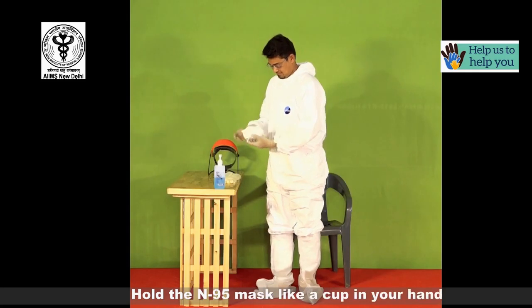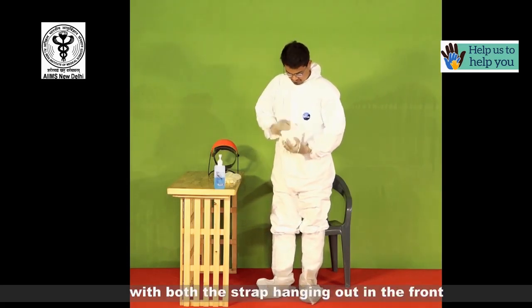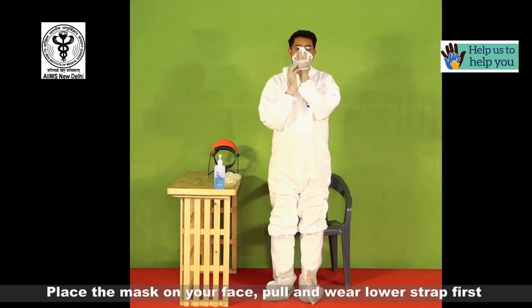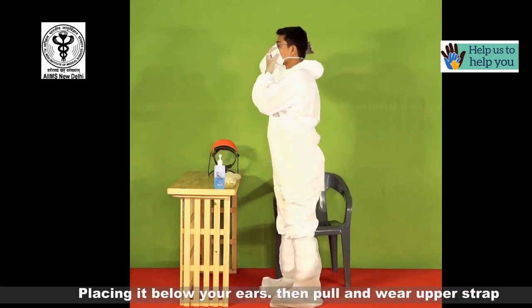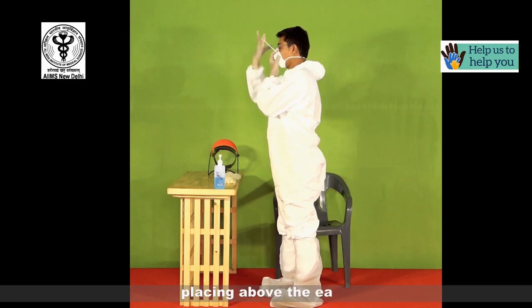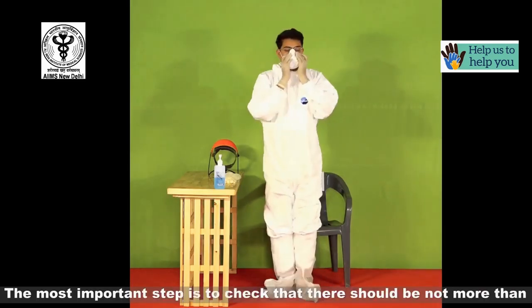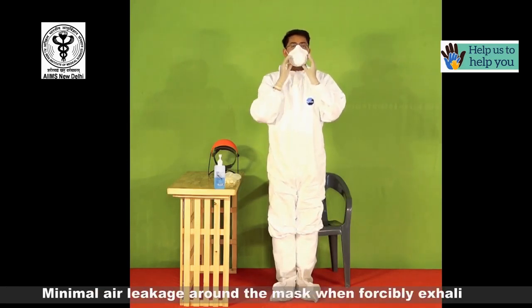Hold the N95 mask like a cup in your hand with both the straps hanging out in the front. Place the mask on your face. Pull and wear the lower strap first, placing it below your ears. Then pull and wear the upper strap, placing it above your ears. The most important step is to check that there should not be more than minimal air leakage around the mask when forcibly exhaling.